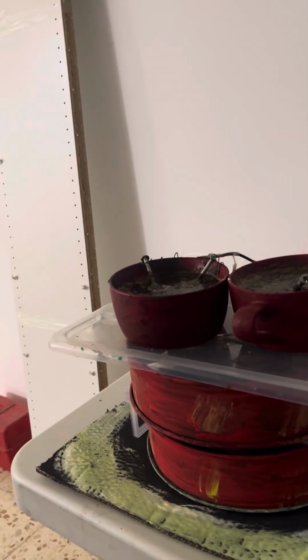But it should be said that after that, I took a sample of just the water from the Mediterranean, from the open bottle, not an airtight bottle, and added a little bit of methylene blue. So watch it. Maybe there's something interesting, something curious, with the Mediterranean water.